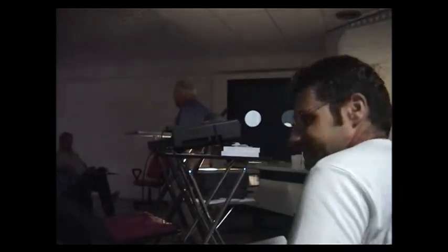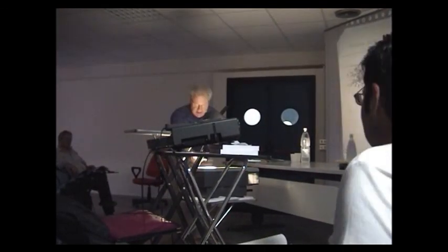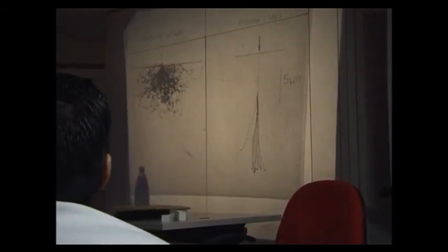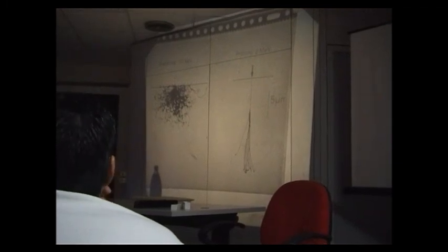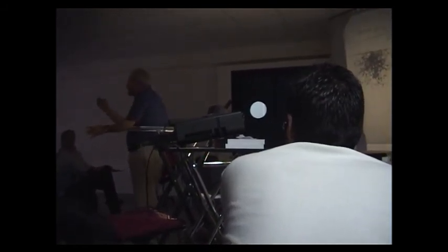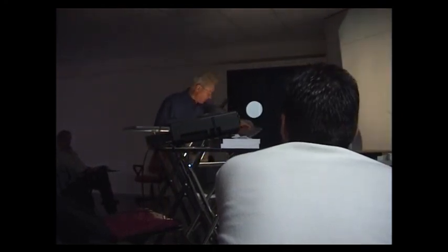When you send 2 MeV protons on the same material, you see that the trajectory is nearly linear, except that at the end of the trajectory, we have the possibility of some scattering. And why do you have some scattering at the end of the trajectory? At the end of the trajectory, the velocity of the incident particle is lower than at the beginning. Then each particle passes a longer time around the nucleus, and as the time of interaction is longer, the possibility of scattering is also more probable.